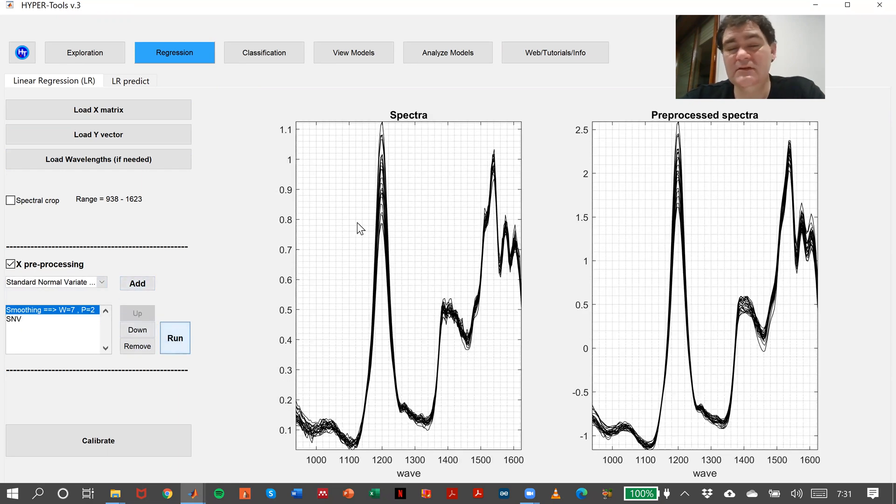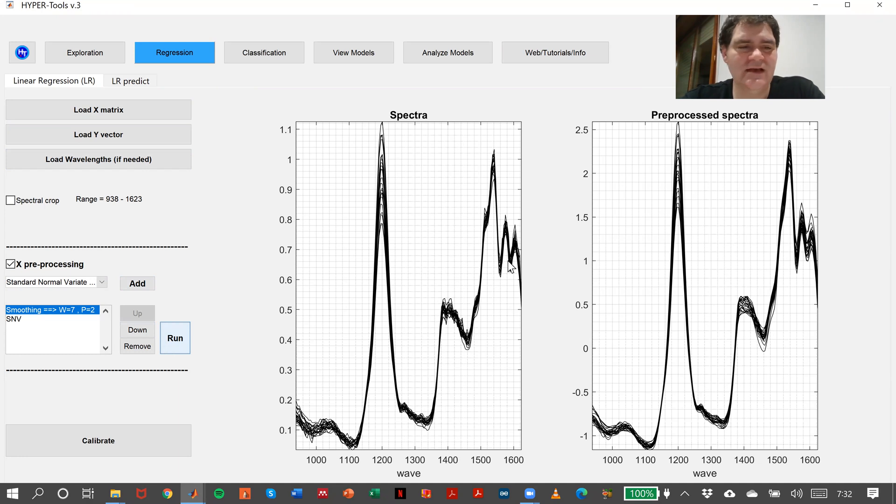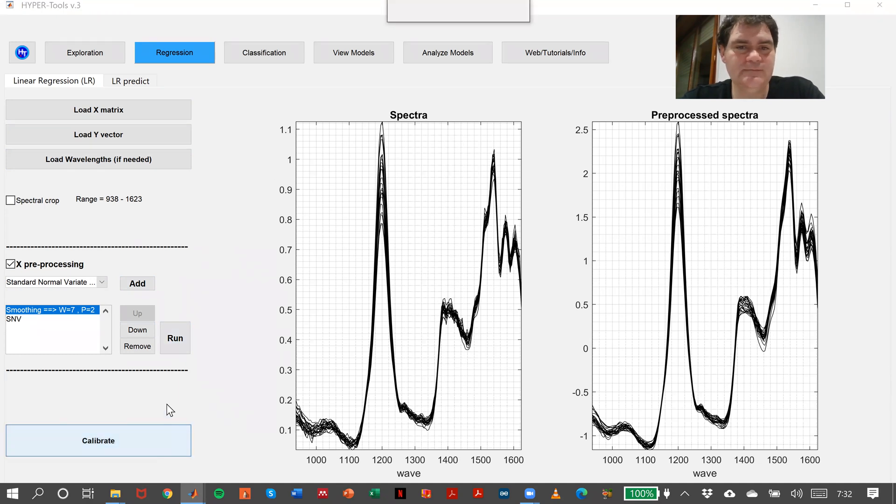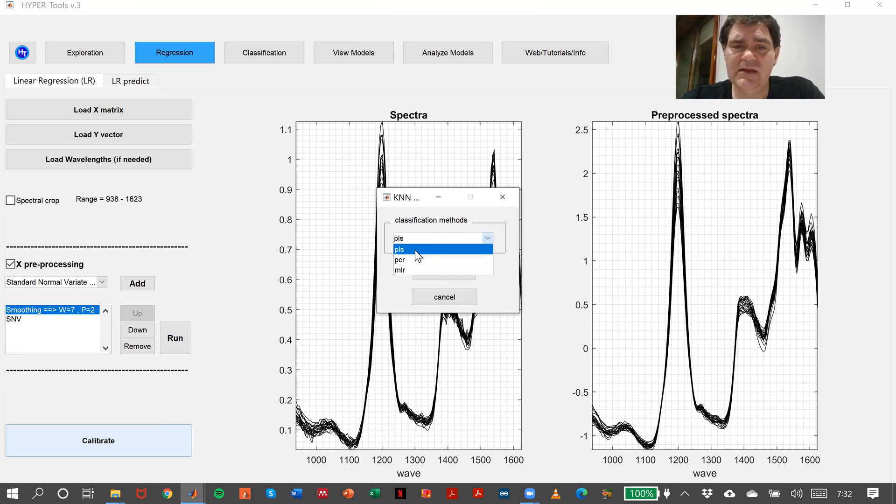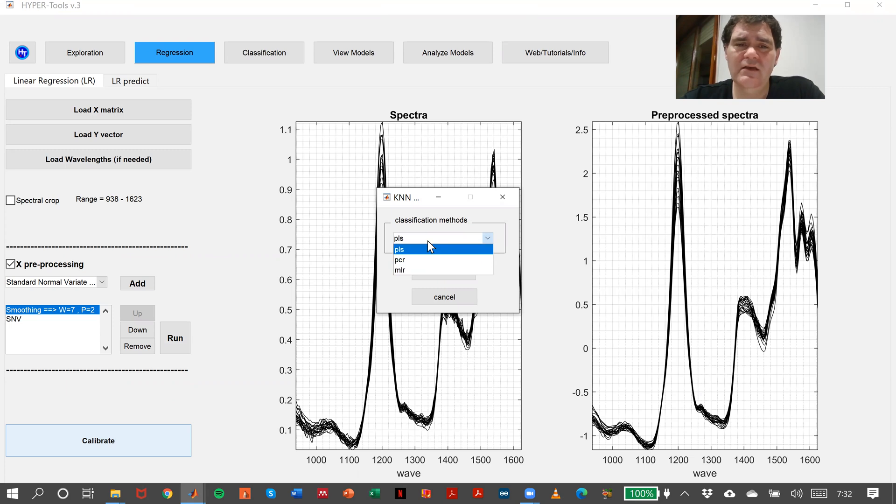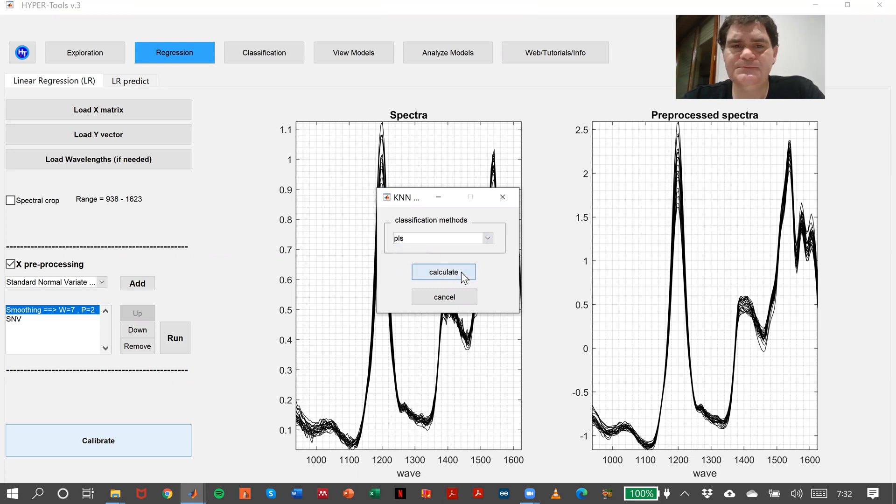In this case there's not much change; it's just a simple simulation. In calibrate, press calibrate. Here I have three possibilities: PLS, PCR, MLR. Let's do just a PLS model.